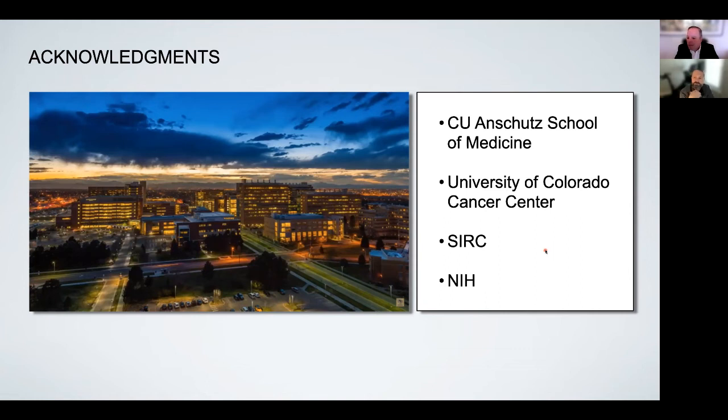Gotcha. And would things like formaldehyde fixation, or binding those molecules together, is that within the scope of CryoEM too? Yeah, so cross-linking is a very powerful approach for either stabilizing a complex or looking at interactions like you're thinking of.